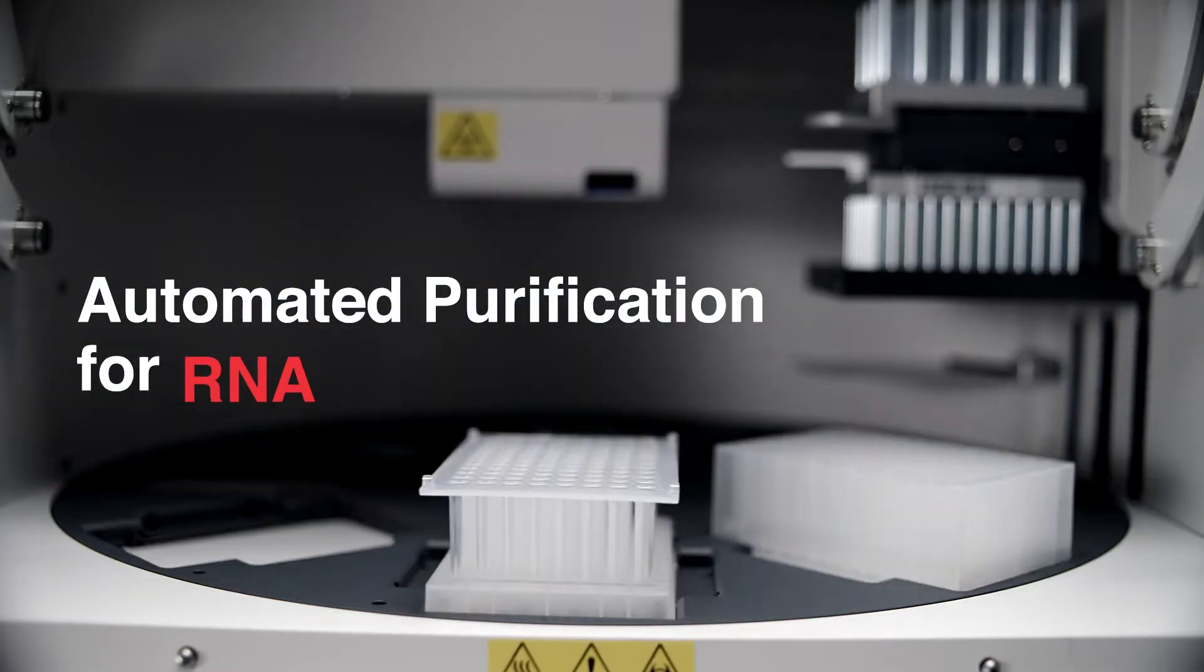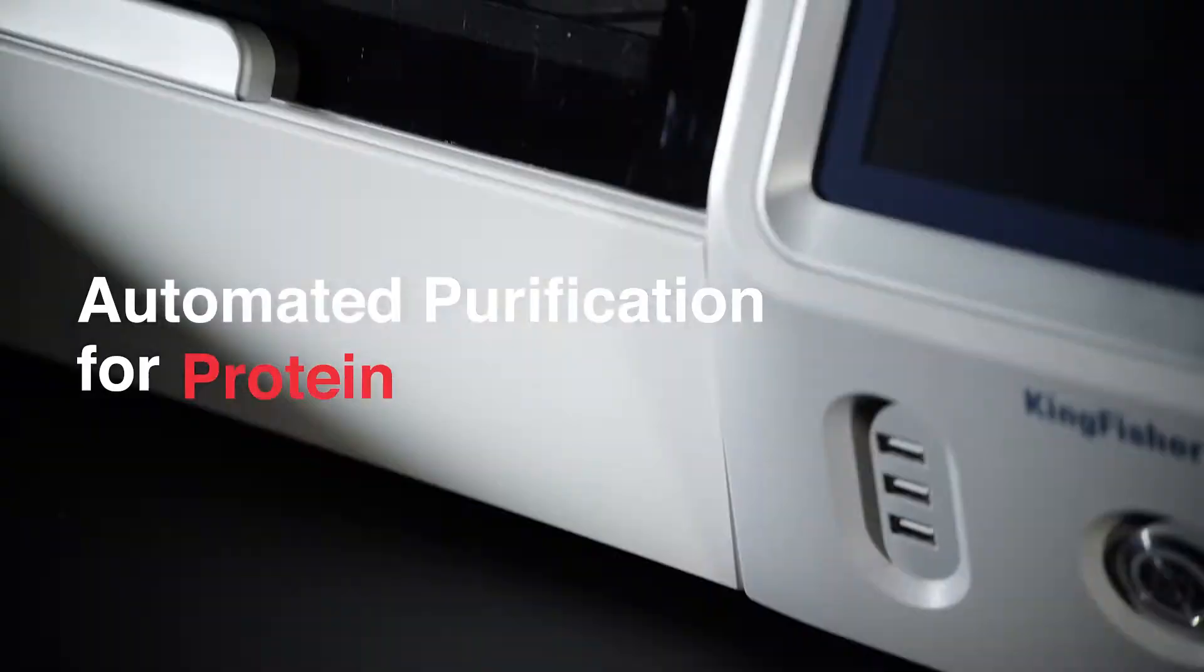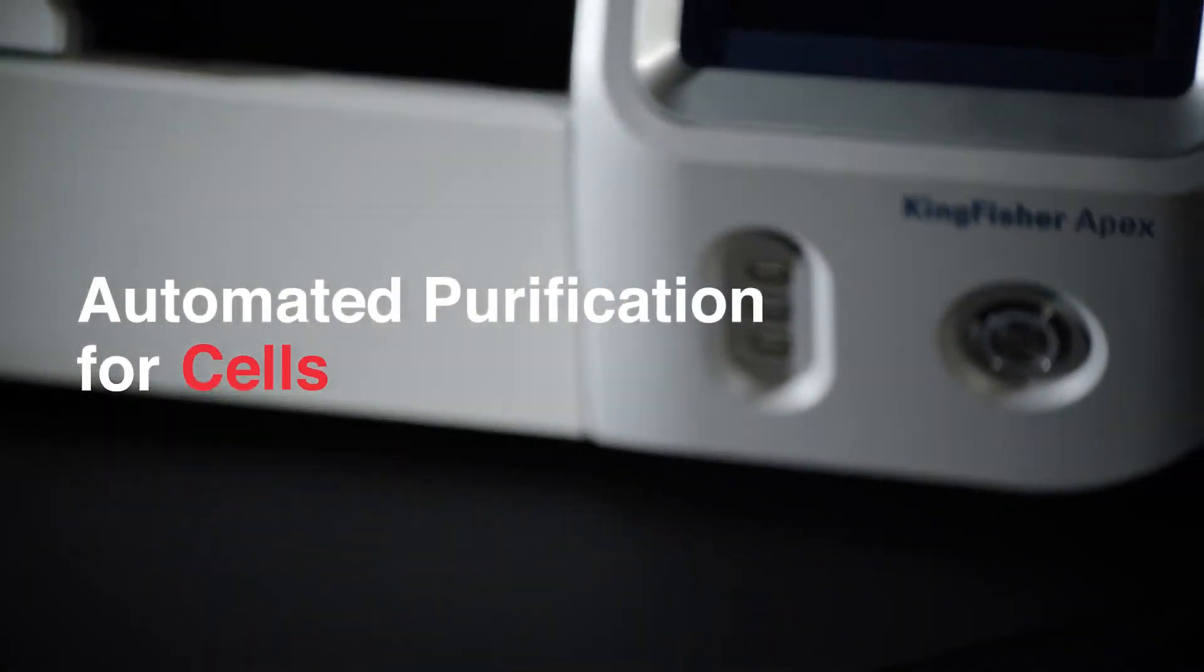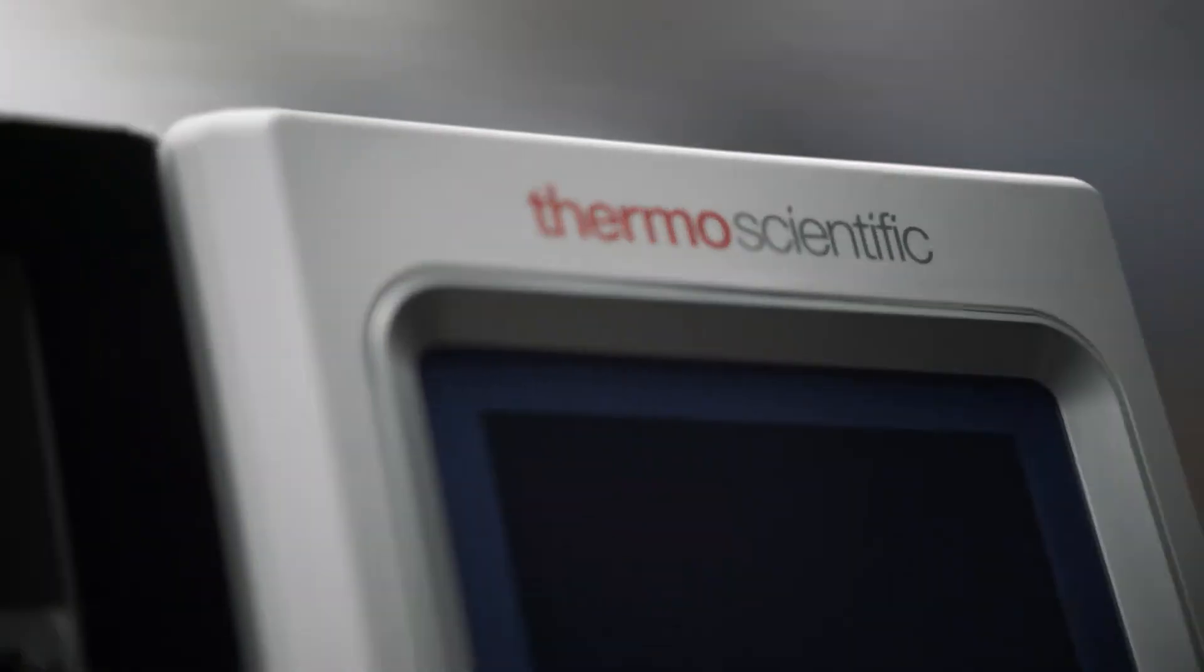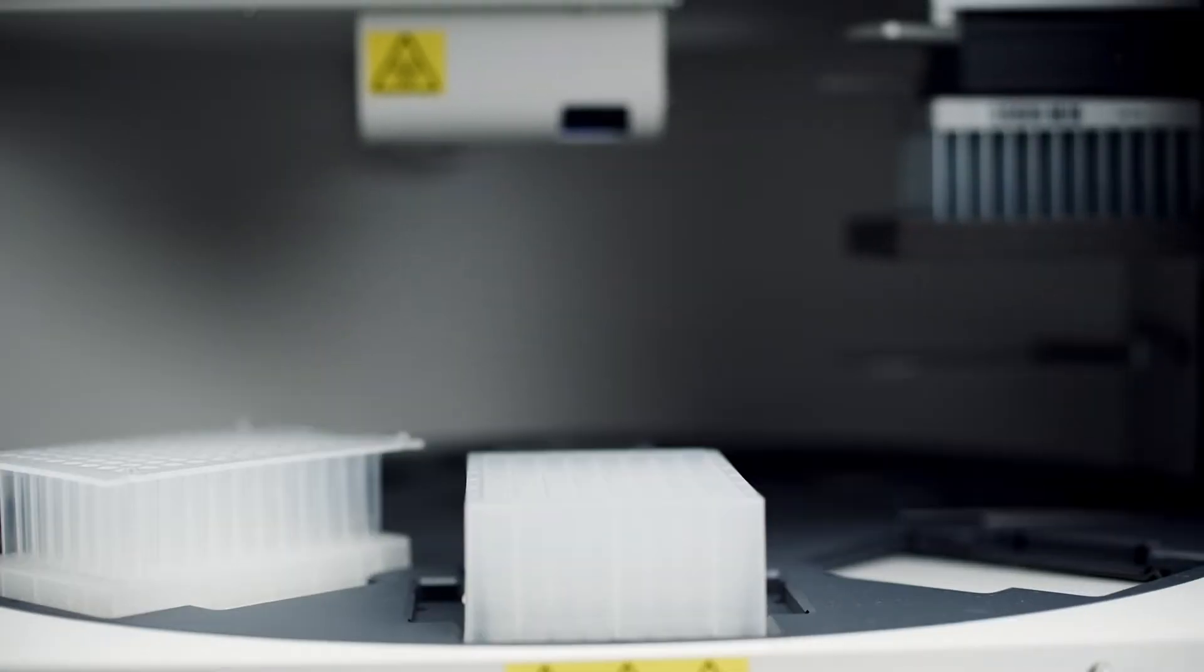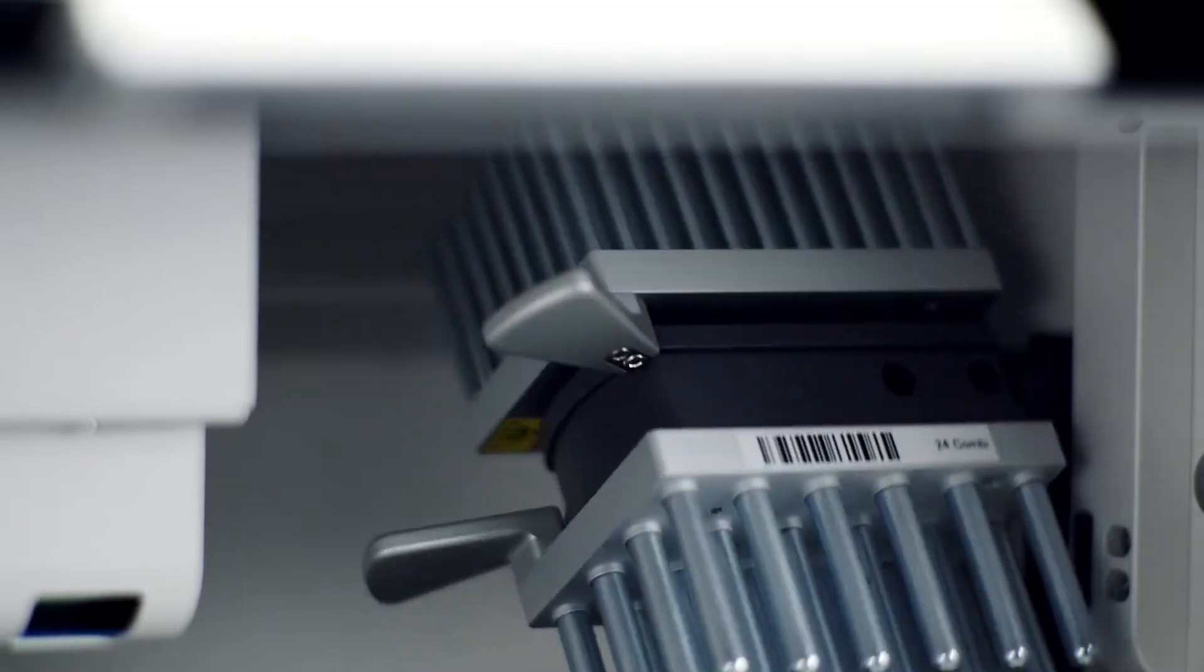Isolate DNA, RNA, proteins, or cells using validated protocols, or customize your own. This is sample prep as it should be: fast, flexible, consistent.